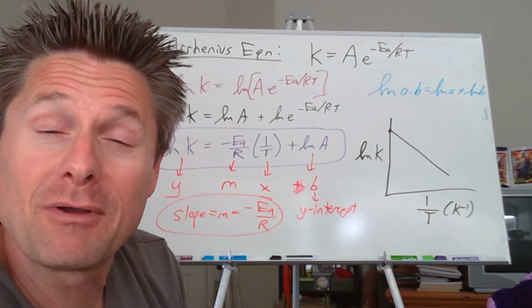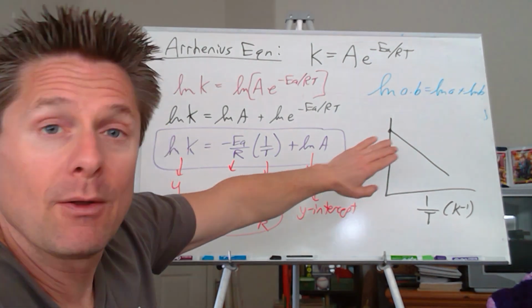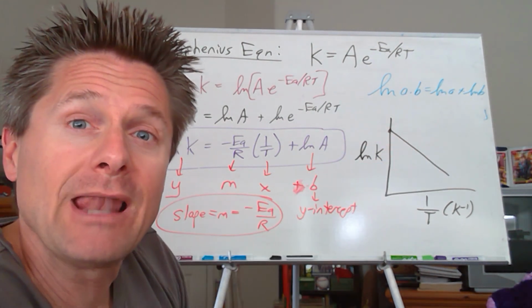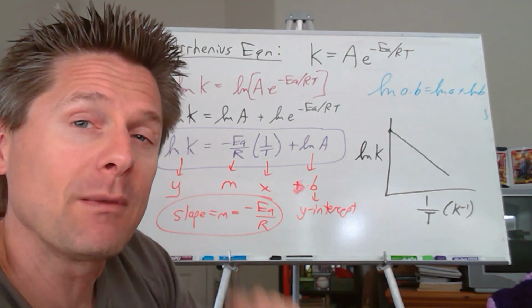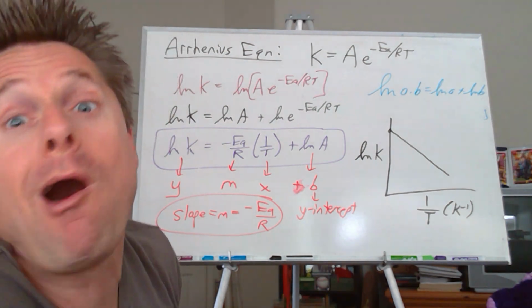I mean, you need to turn this in with your lab. I want that graph. That's a key graph because we need the slope from that. You right click on any data point, add trend line, add equation to chart. It'll give you the y equals mx plus b. You could actually calculate the pre-exponential factor if you wanted to.